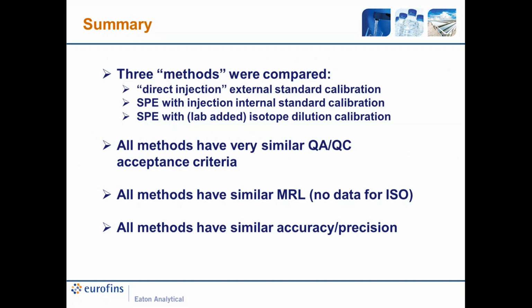In summary, we compared three methods: one direct inject method, one SPE internal standard calibration, and one SPE isotope dilution calibration. All methods have similar QC acceptance criteria, similar MRLs, and similar accuracy and precision.